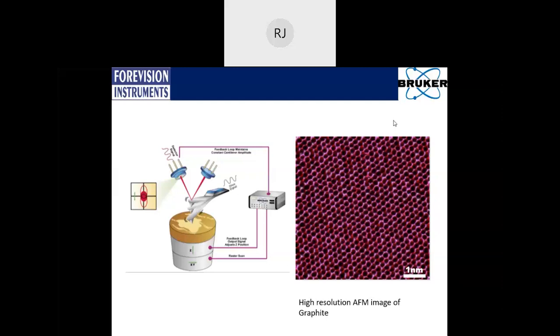Like the first one we always look at is a cantilever, which is more crucial because this is the instrument which will detect the force of attraction or repulsion between the sample and the cantilever. Based on the forces, the cantilever will deflect, and this deflection has to be detected. For that, we use a photodiode with position sensitivity and a laser. The laser and photodiode combination is a detector, the cantilever is a sensor, and then we have a scanner unit. The scanner unit will scan the sample.